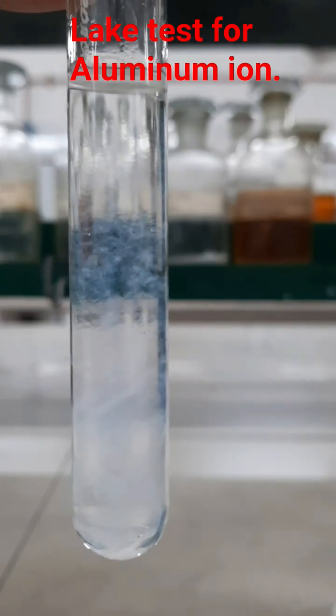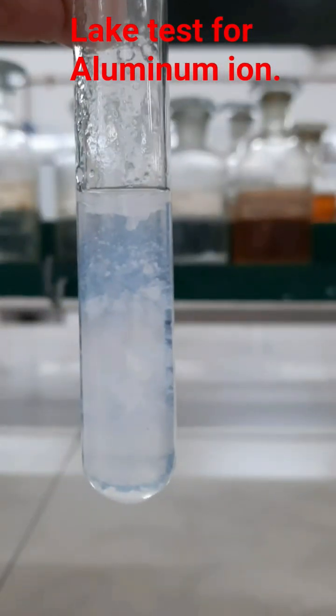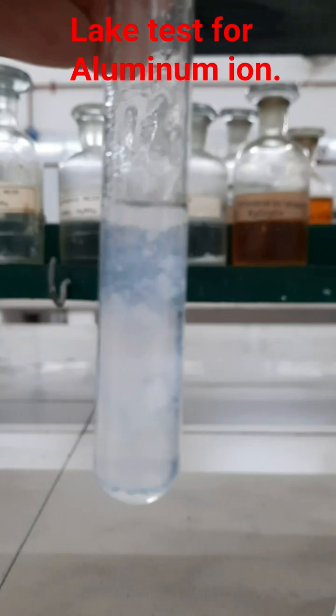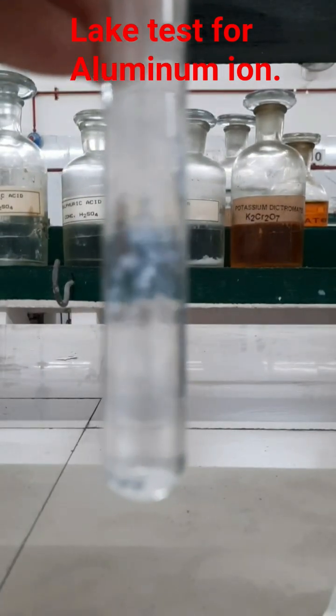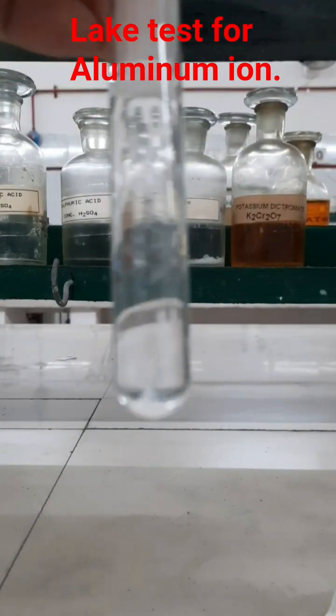Add dilute HCl into the precipitate till the precipitate dissolves completely. After adding this dilute HCl, you can see the precipitate dissolves completely.